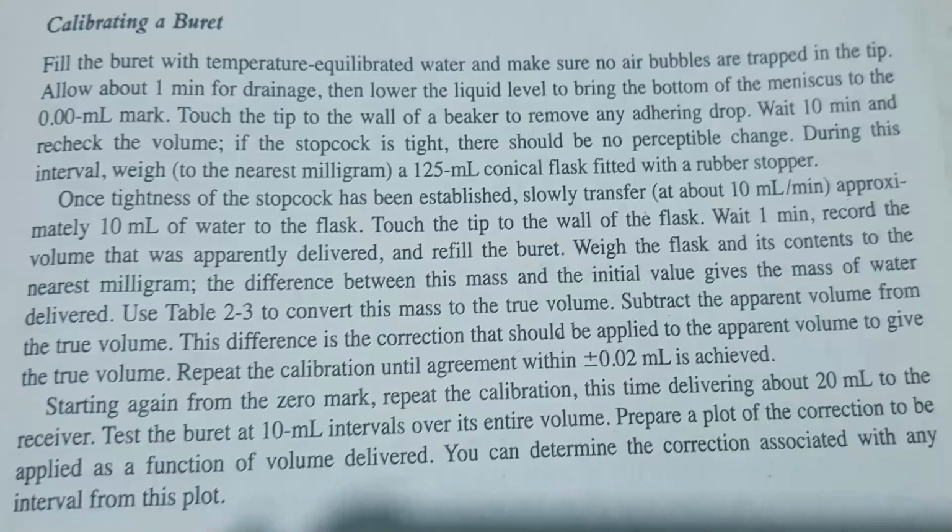So you have to fill the burette, right? You fill it with temperature-equilibrated water, and make sure there are no bubbles trapped in the tip of the burette. Then allow about 1 minute for drainage, and lower the liquid level to bring the bottom of the meniscus to the 0.00 ml mark. Then touch the tip to the wall of a beaker to remove any adhering drop from the tip of the burette, and then wait 10 minutes and recheck the volume.